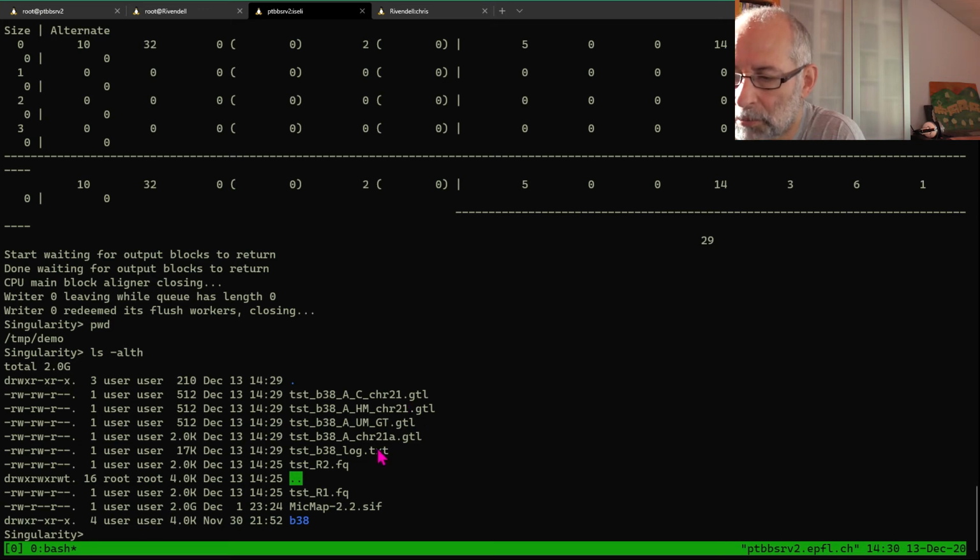And then the mappings themselves: those that are good maps directly in the chromosome, those that are chimeric with a capital C, those reads that are half mapped with HM, and those that are unmapped with the UM header.